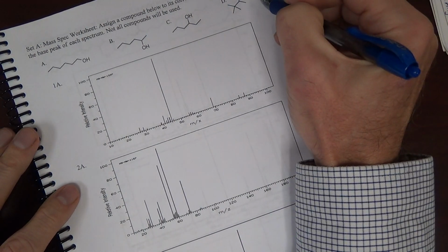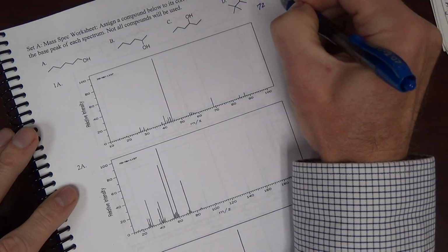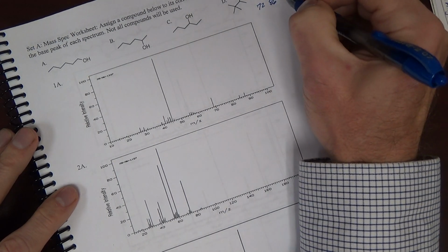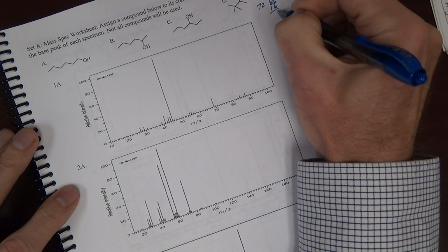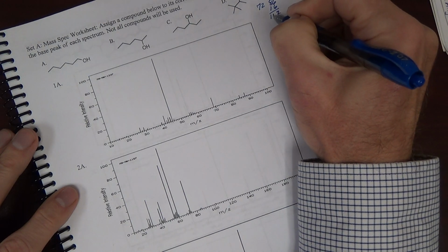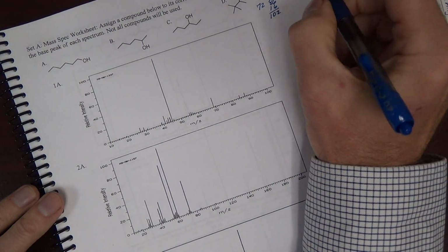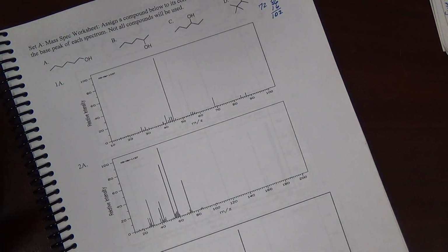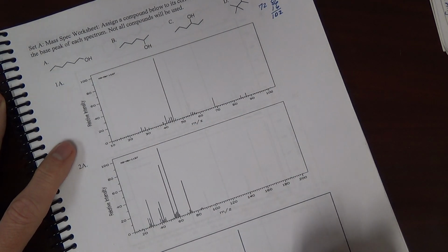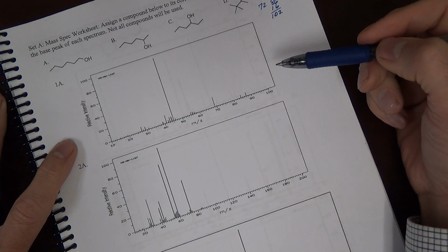That means 6 times 12 would be 72. 14 makes that 86. And 16 is going to make that 102. Every compound up there is 102. That's not going to help us distinguish. We need to look at cleavage.